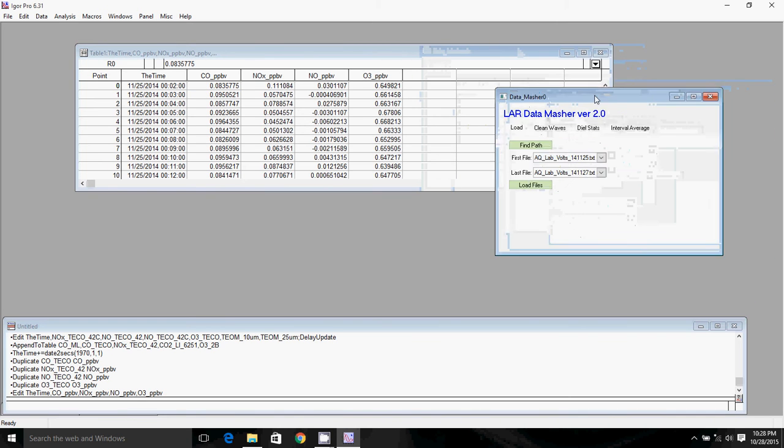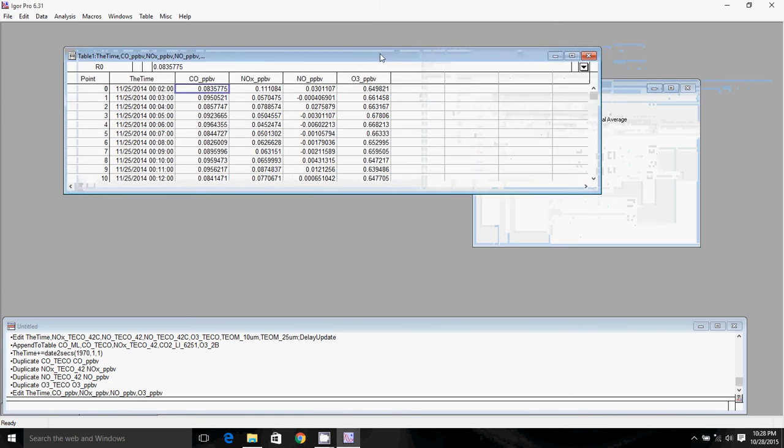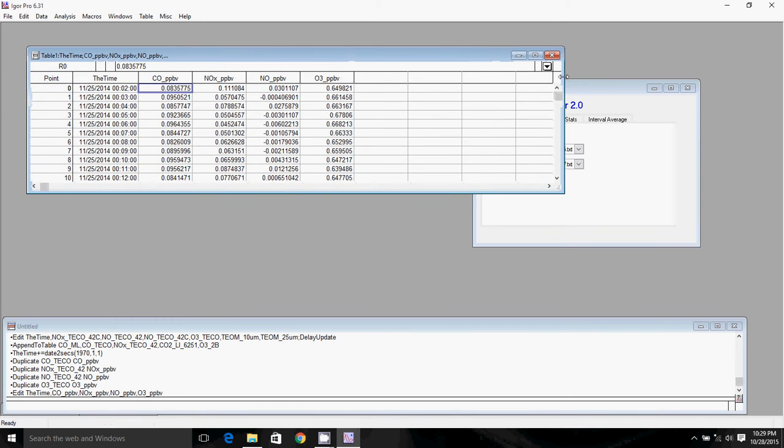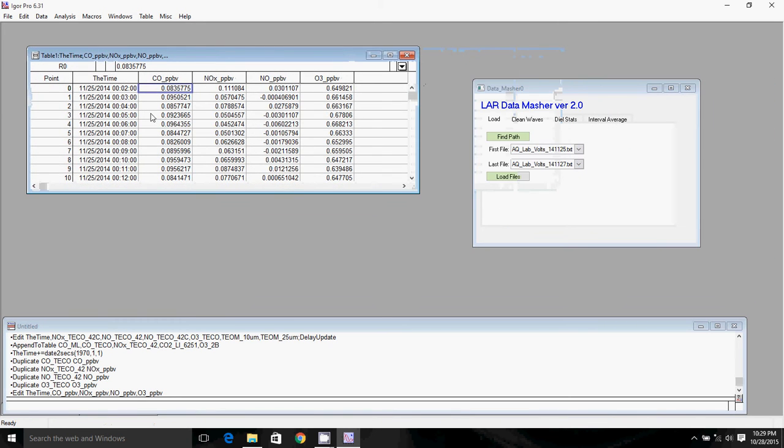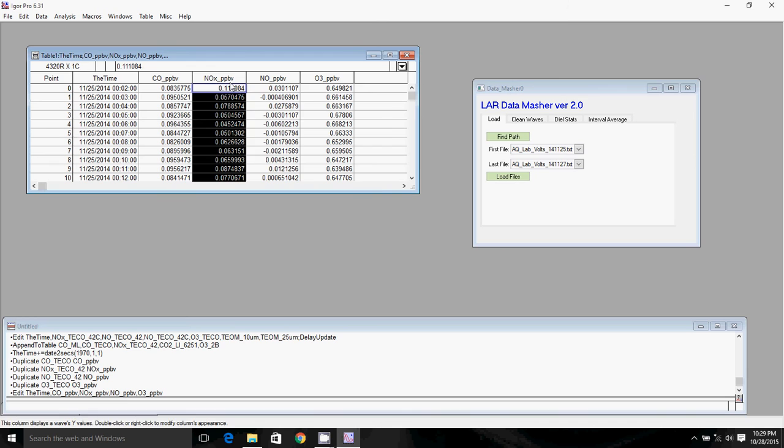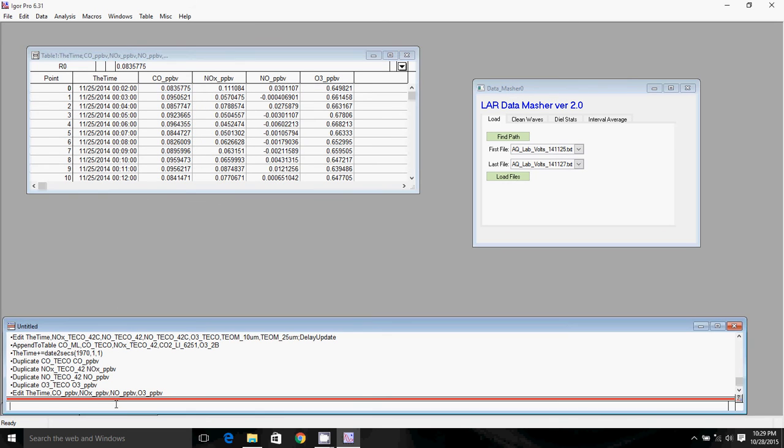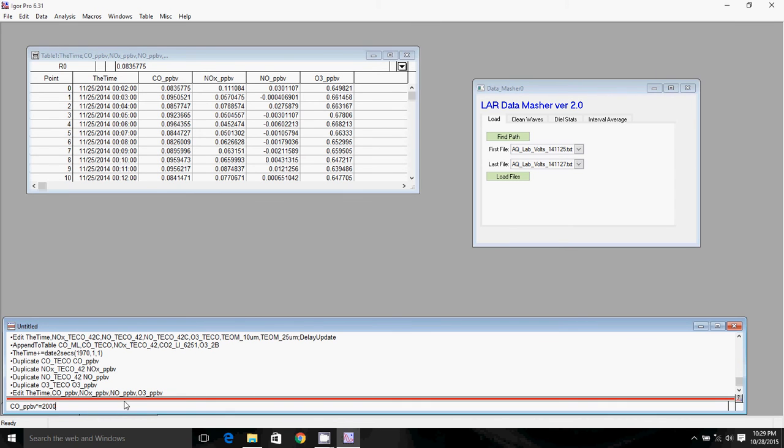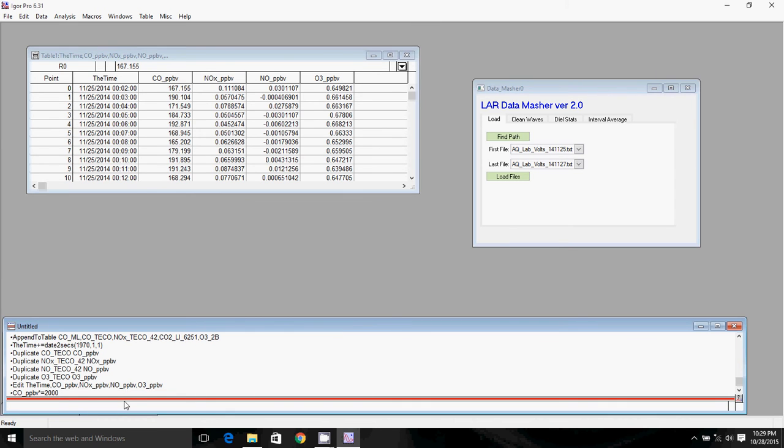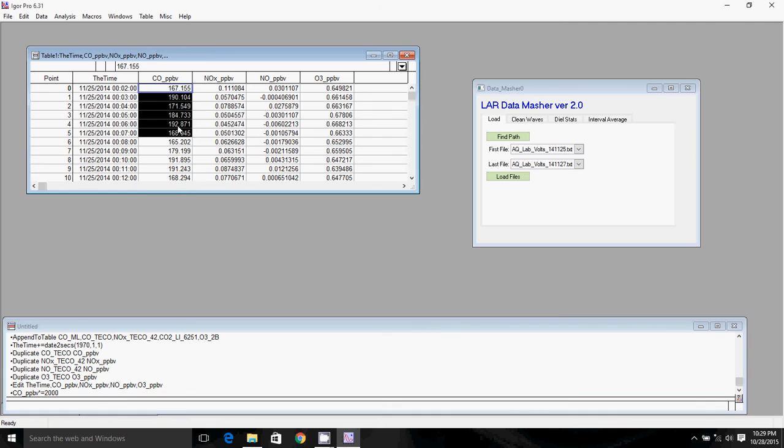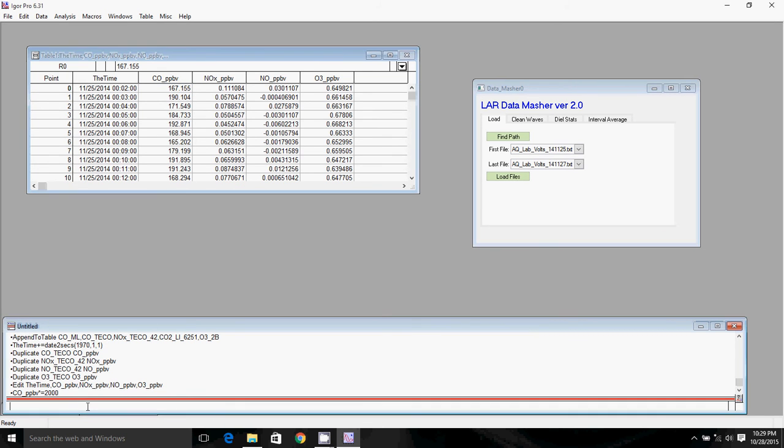So now what we've got to do is convert our voltage readings here into parts per billion. We're going to do that by simply multiplying by our response factor. So for CO, the response factor is 2,000 parts per billion per volt. So we're going to say CO times equals. Times equals means we're multiplying by every element in the wave, 2,000. As you can see here, we've got realistic-looking CO readings in parts per billion.